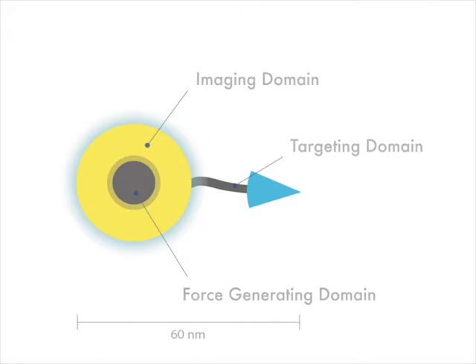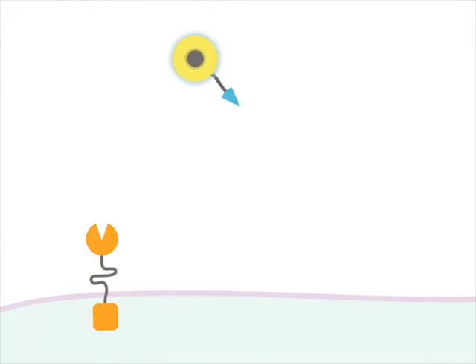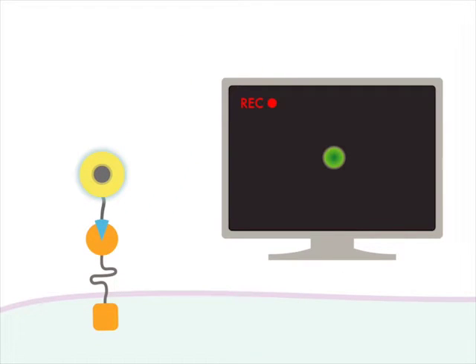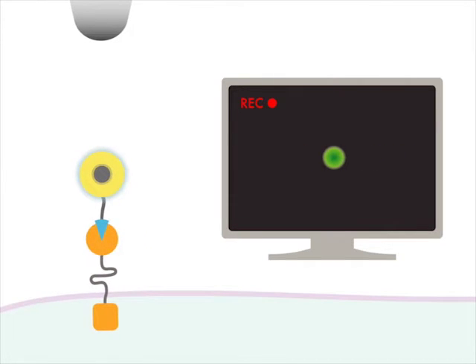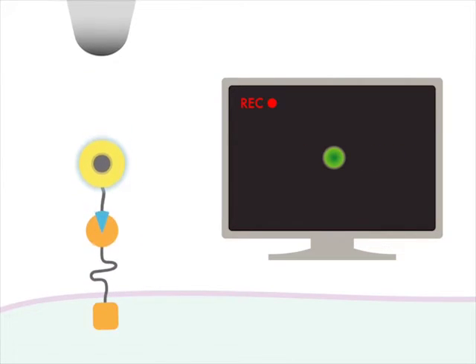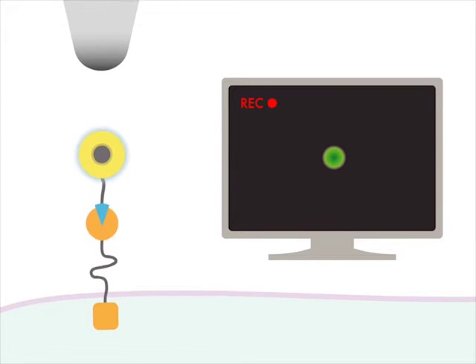Using the targeting region, nanoprobes are specifically attached to target receptors at the cell surface, then manipulated with a magnetic tweezer. Spatial manipulation is imaged with dark field microscopy, and stronger forces can be applied to induce receptor activation. These nanoprobes are extremely powerful and widely applicable. Any receptor of interest can be specifically targeted through the modular functionalization domain of the nanoparticles and then mechanically activated.